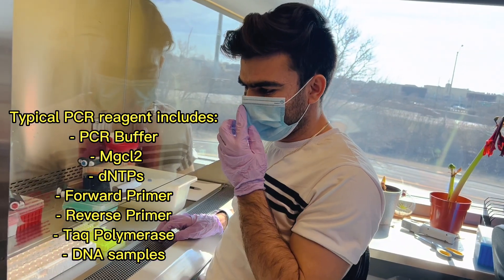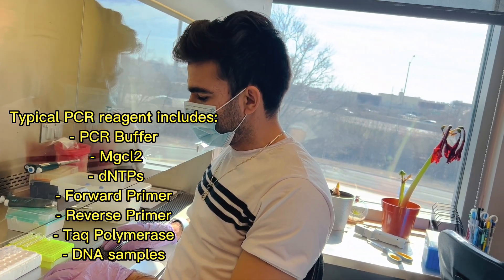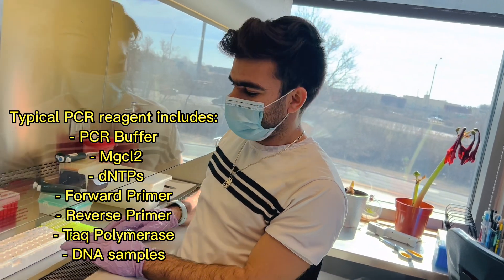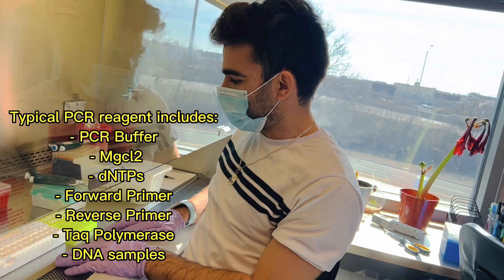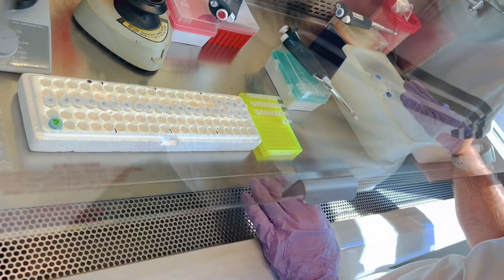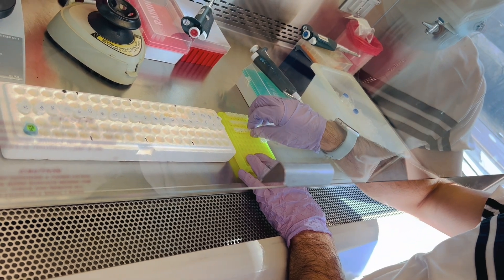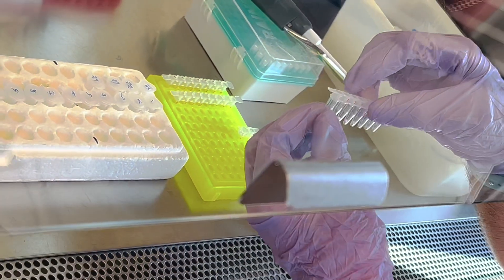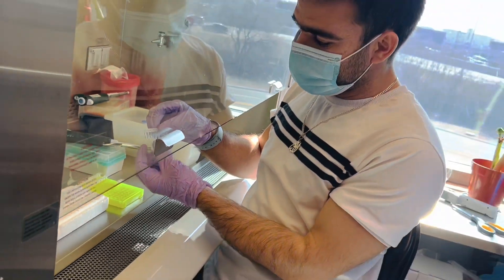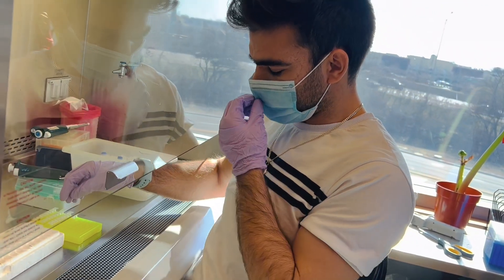A typical PCR reagent includes PCR buffer, magnesium chloride, dNTPs, forward primer, reverse primer, Taq polymerase, and the sample DNA. We have our sample DNA and our master mix of forward and reverse primer. For Taq polymerase, PCR buffer, and dNTPs, I am going to use bead tubes, which already include these components, so I do not need to add them separately.